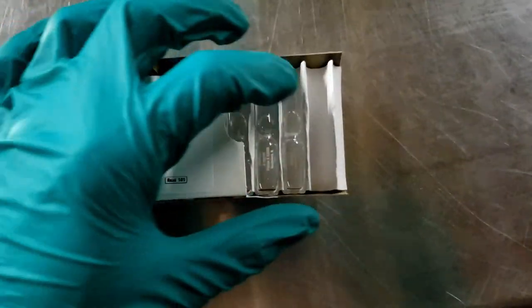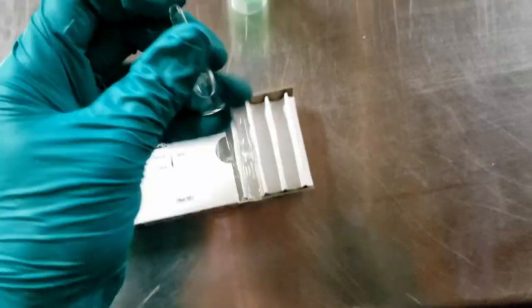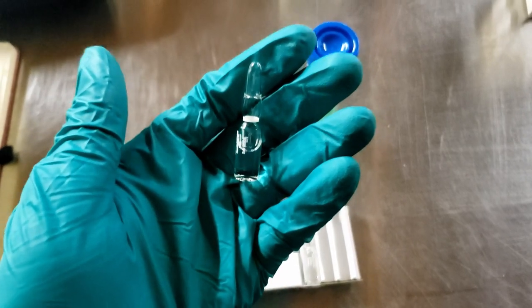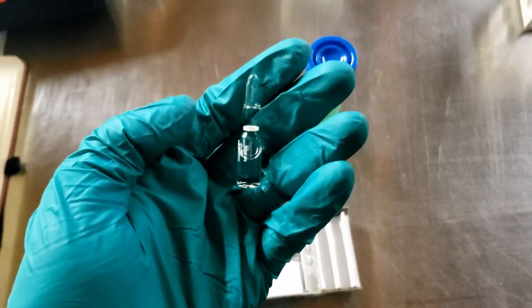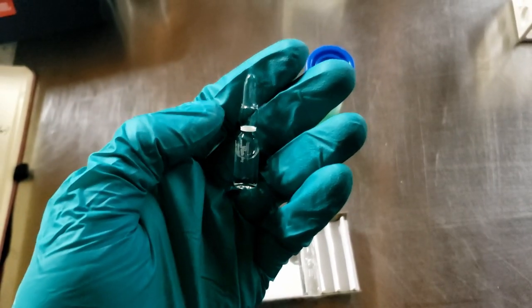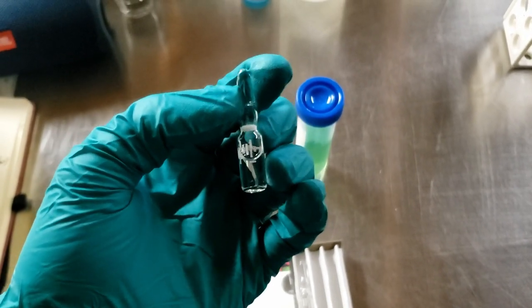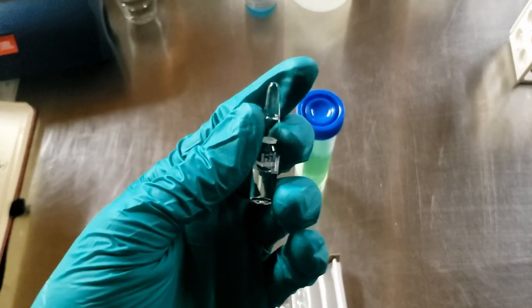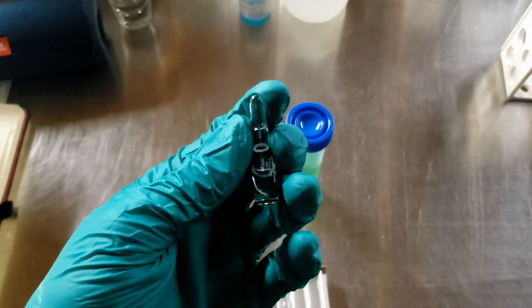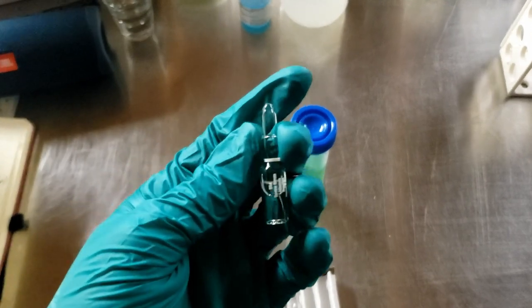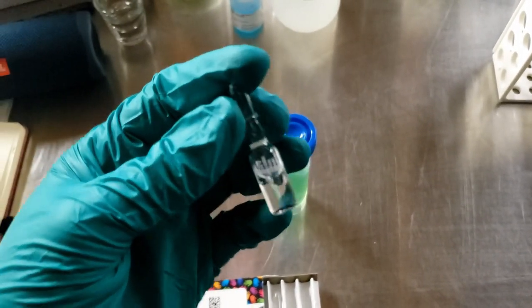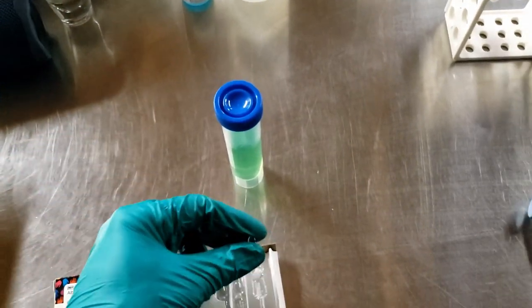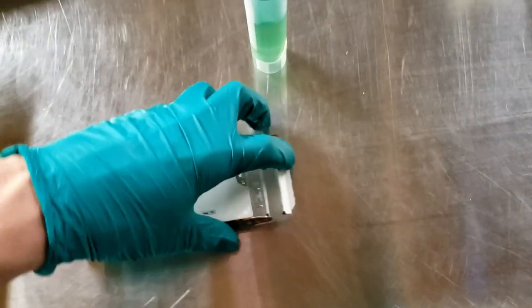It comes in a little glass ampule, and there's no reason to be afraid of these. These are actually really cool. There's one milliliter of two grams per liter BSA, Bovine Serum Albumin, in each of these glass ampules. And literally all you do is break the ampule. You can wrap it up in a paper towel and break it within the paper towel to prevent any glass from getting in your hands. But they design these so that they don't shatter into a billion pieces. So just confidently break the ampule and you'll get something like this.